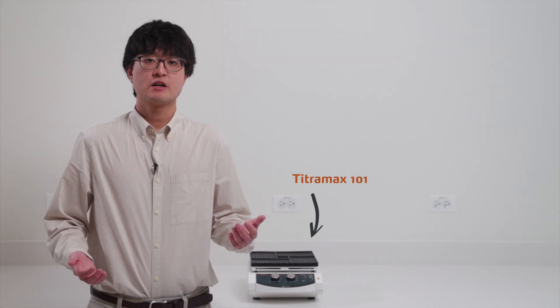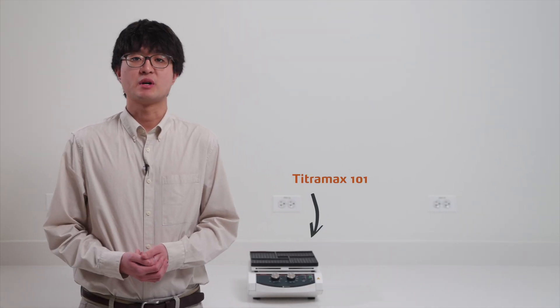This unit also comes with an integrated timer allowing it to shut itself off once the timer is up. If you want something more powerful, then the Titramax 101 is the model for you.